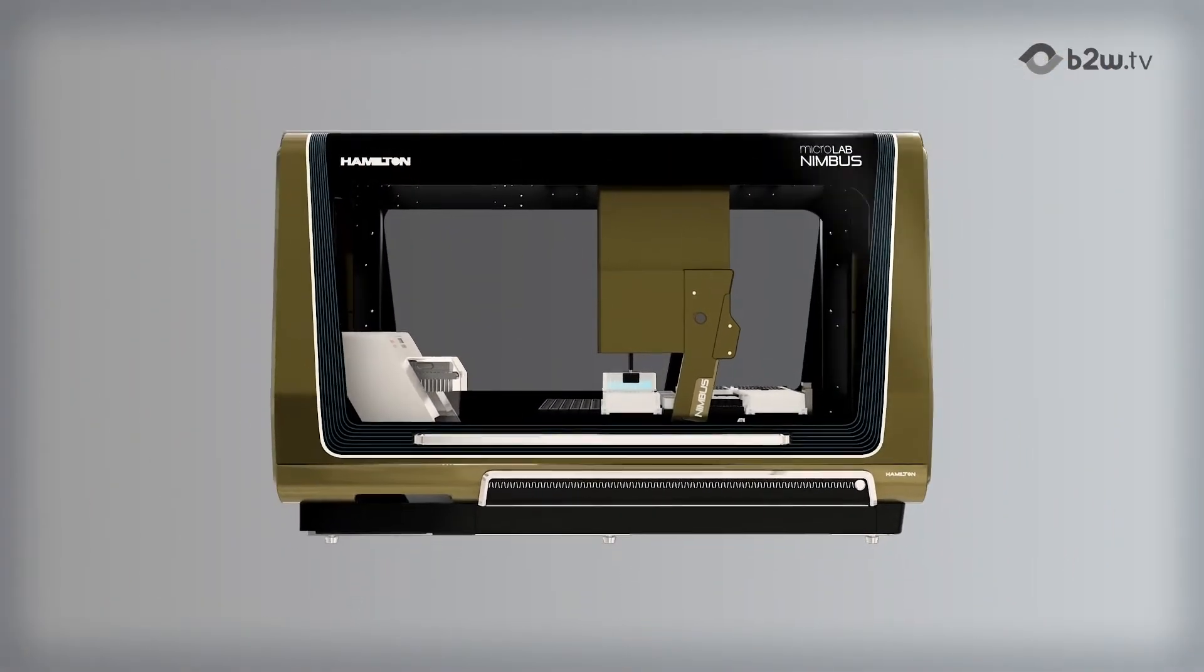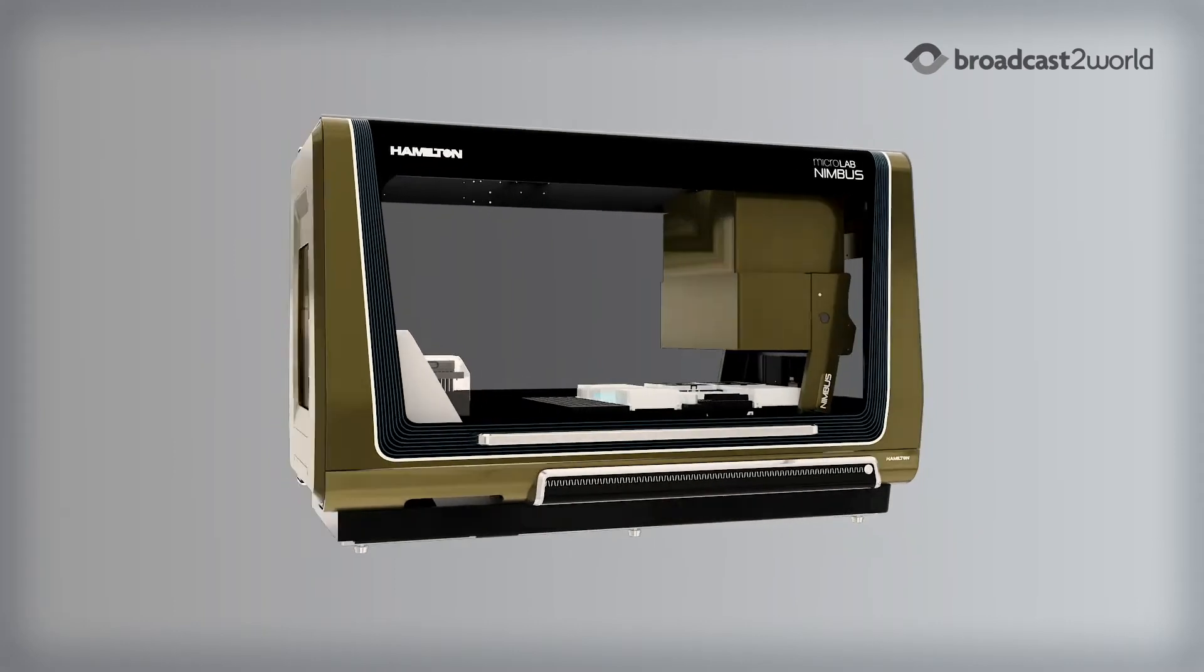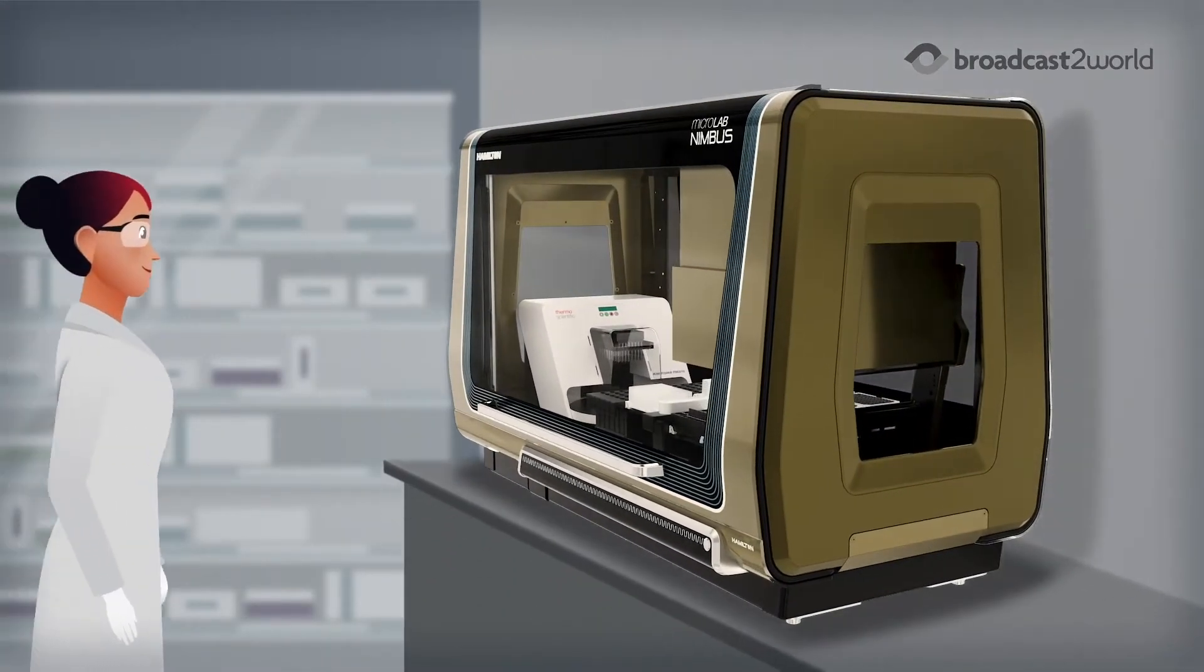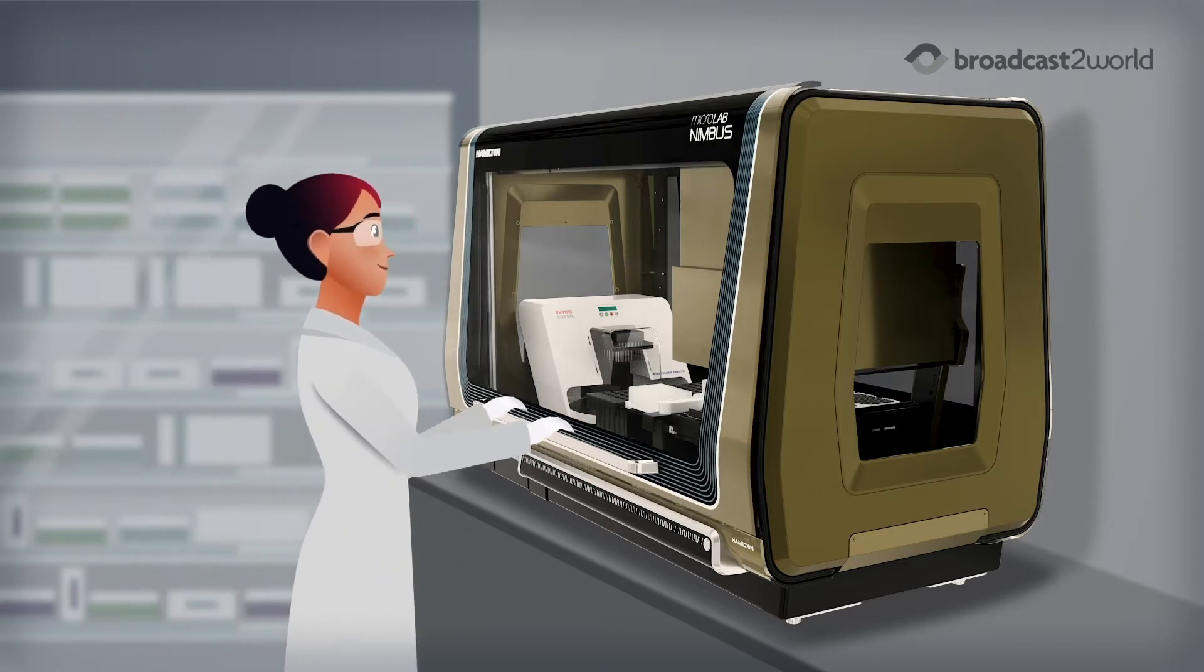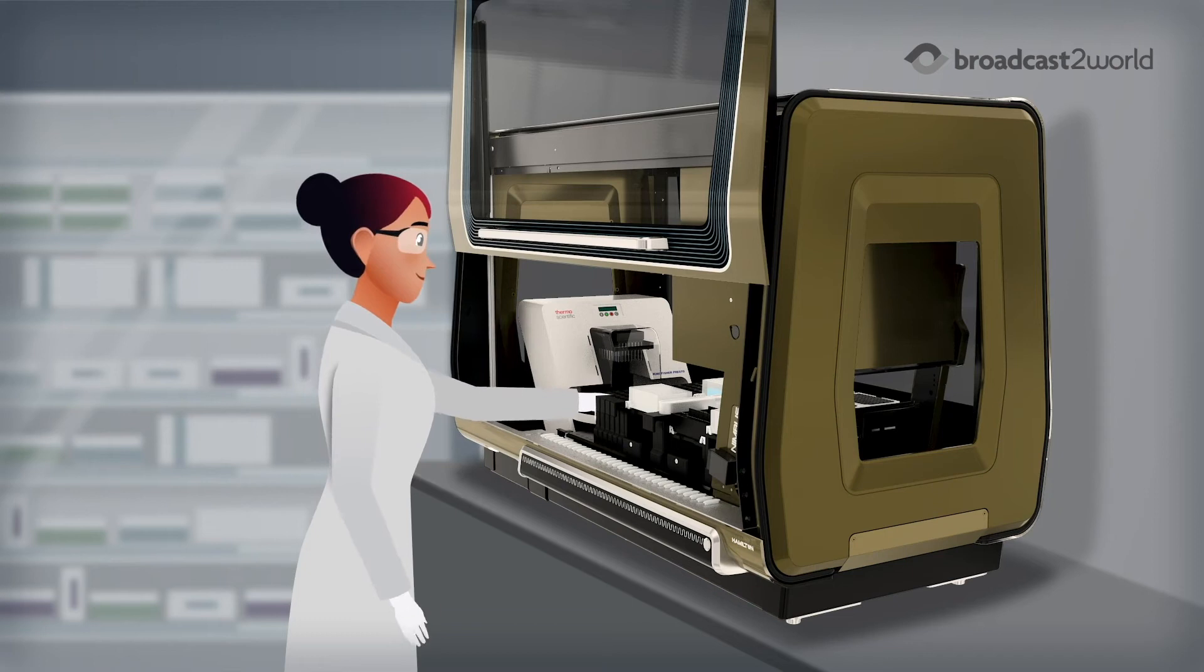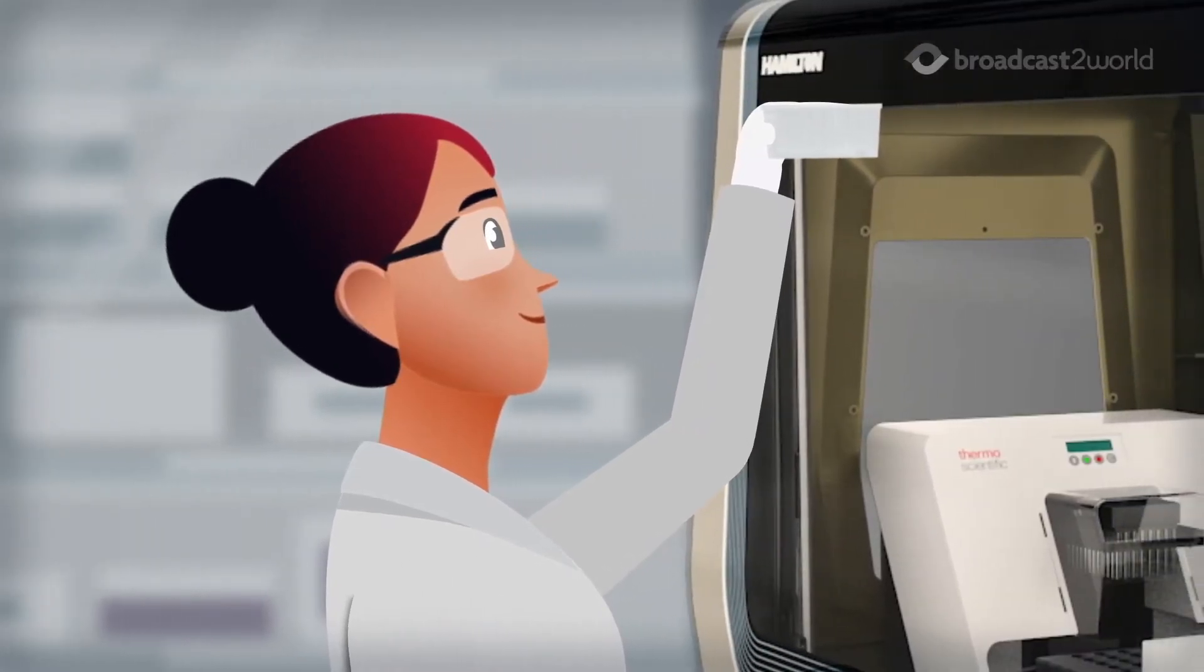The ID Nimbus Presto System, co-developed by Thermo Fisher Scientific and Hamilton, is a simple, walk-away extraction and purification solution that can process the most complex forensic sample types, even bone, tooth, and adhesive samples, extracting and purifying up to 96 samples in about an hour.